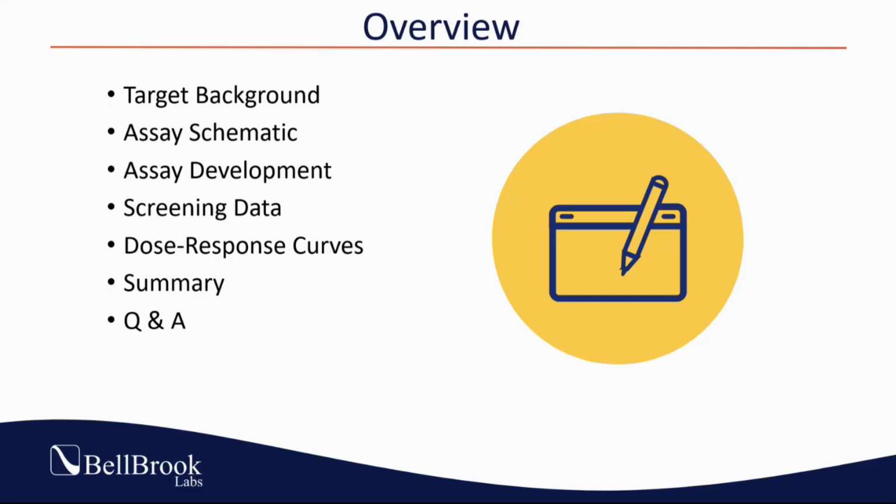of experiments. I will then talk about the screening data that we generated, doing a pilot screen for compounds that potently inhibit VPS4A, and then how we did a selectivity profile to detect off-target effects in VPS4B and other related AAA ATPases. Finally, I will summarize what we talked about, and then I will review the collected questions that we recorded during our Q&A.